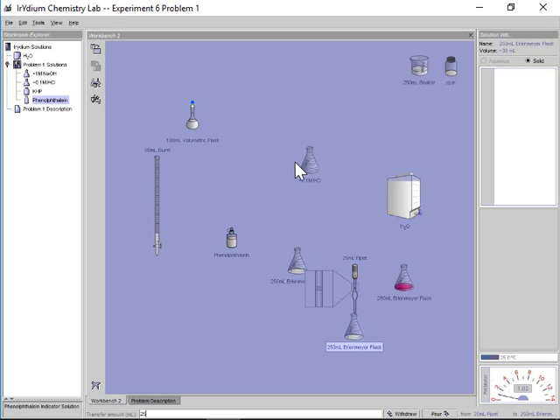So always it's good to make up a big vat of unknown base, unknown acid. You might waste a little bit during the titration just to find the actual concentration. Concentration is intensive. It can actually figure out what the molarity of that stock container, stock bottle is.